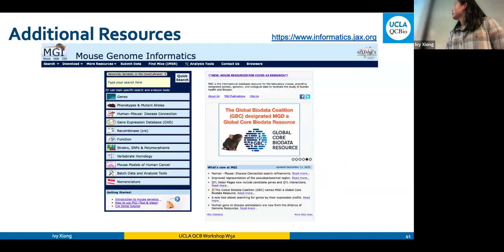And then for mouse, there's another website called Mouse Genome Informatics. It has more in-depth annotation in case you wanted to see beyond genomes. There are different mutations and different annotations, phenotypes, SNP information, etc. So if you want to integrate your RNA-seq analysis with other readouts, you can have a look at this website. And of course, for human-mouse comparisons, you can get the orthologs information from here, which I used before, very handy. Otherwise, if you think about doing it manually, it's going to be a nightmare.